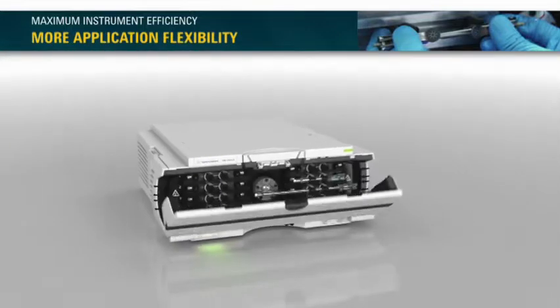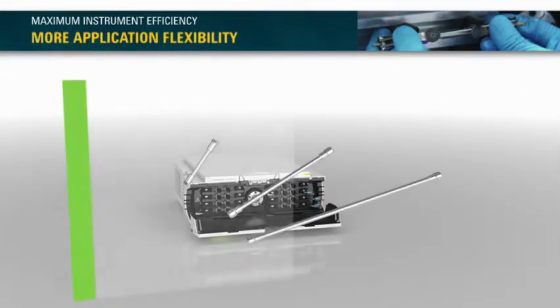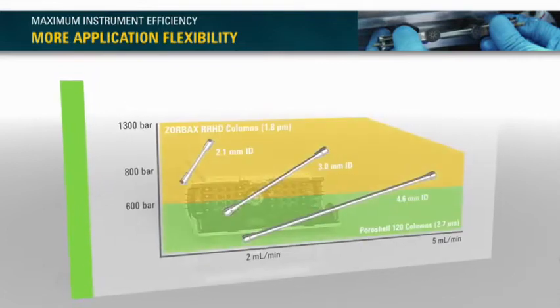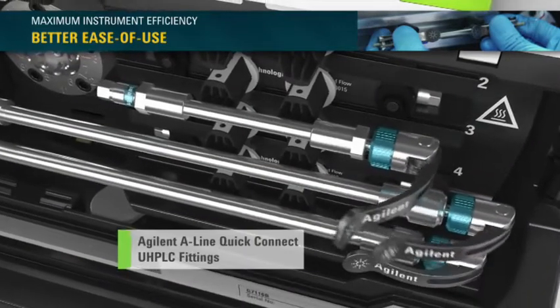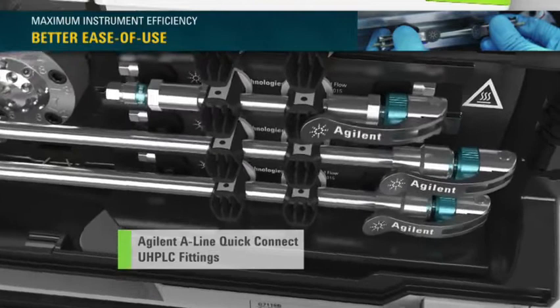Deploy columns with any particle size and any inside diameter for more application flexibility to meet any separation challenge. Quick Connect fittings give you dead volume-free connections to your columns. The fittings just click into place.